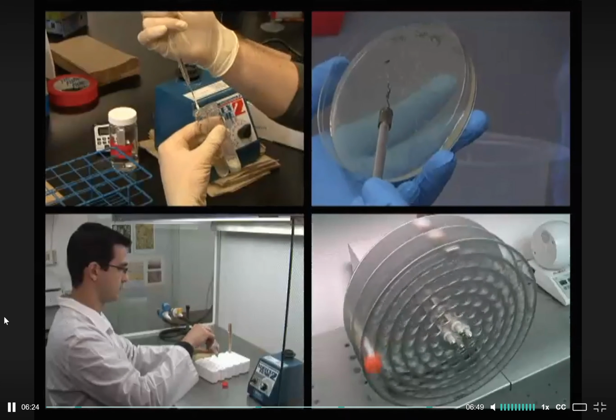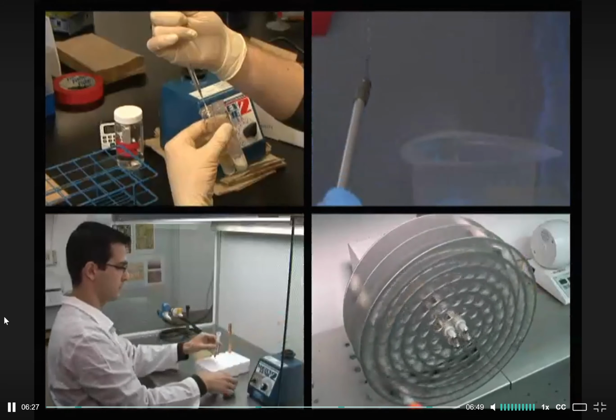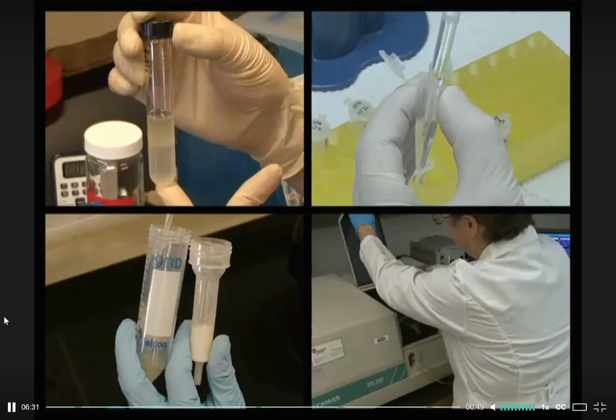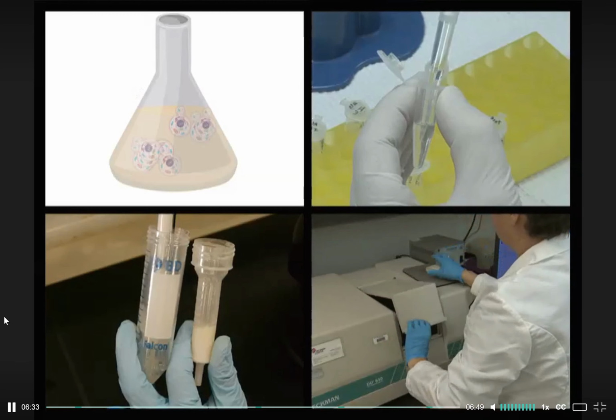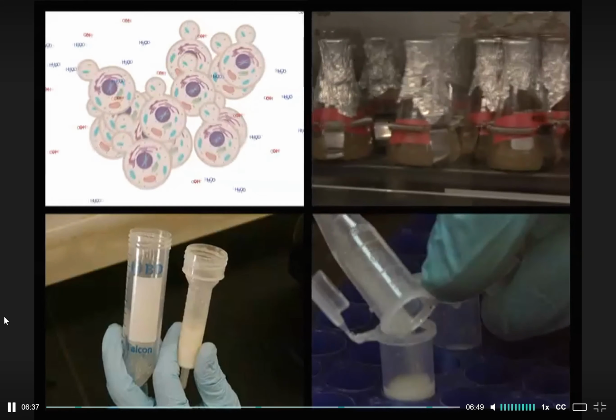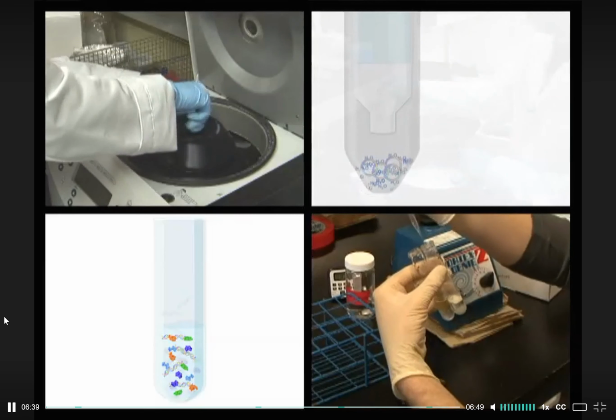You've just watched JoVE's video on isolating nucleic acids from yeast. You should now understand the basic aspects of purifying nucleic acids, such as how to prepare yeast cells for lysis and how to perform different extraction and isolation procedures.